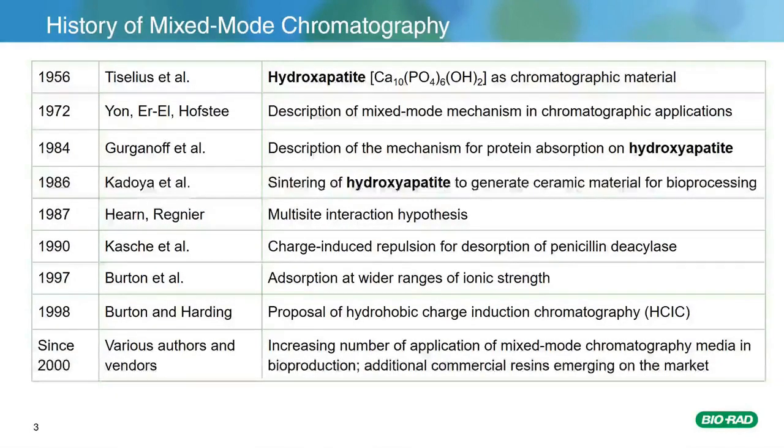Over time, we have seen increasing numbers of mixed-mode chromatography media on the market and their emerging applications in bioseparation. The newer resins are polymer-based, with their surface modified with various charge and hydrophobic functionalities.